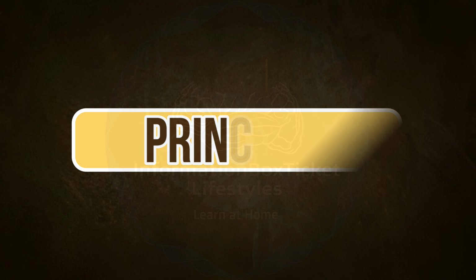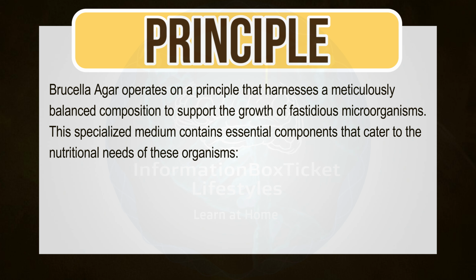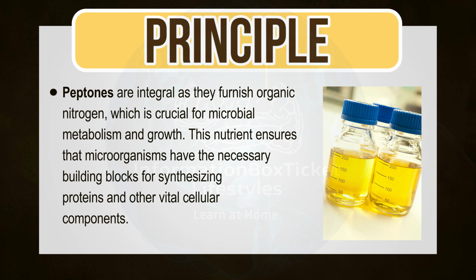Principle of Brucella agar. Brucella agar operates on a principle that harnesses a meticulously balanced composition to support the growth of fastidious microorganisms. This specialized medium contains essential components that cater to the nutritional needs of these organisms. Peptones are integral as they furnish organic nitrogen, which is crucial for microbial metabolism and growth. This nutrient ensures that microorganisms have the necessary building blocks for synthesizing proteins and other vital cellular components.